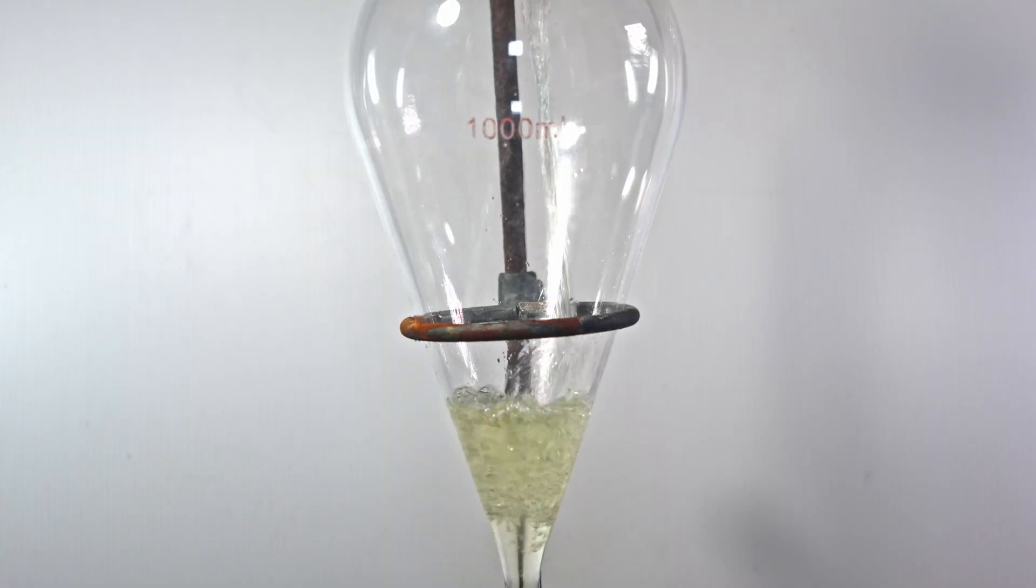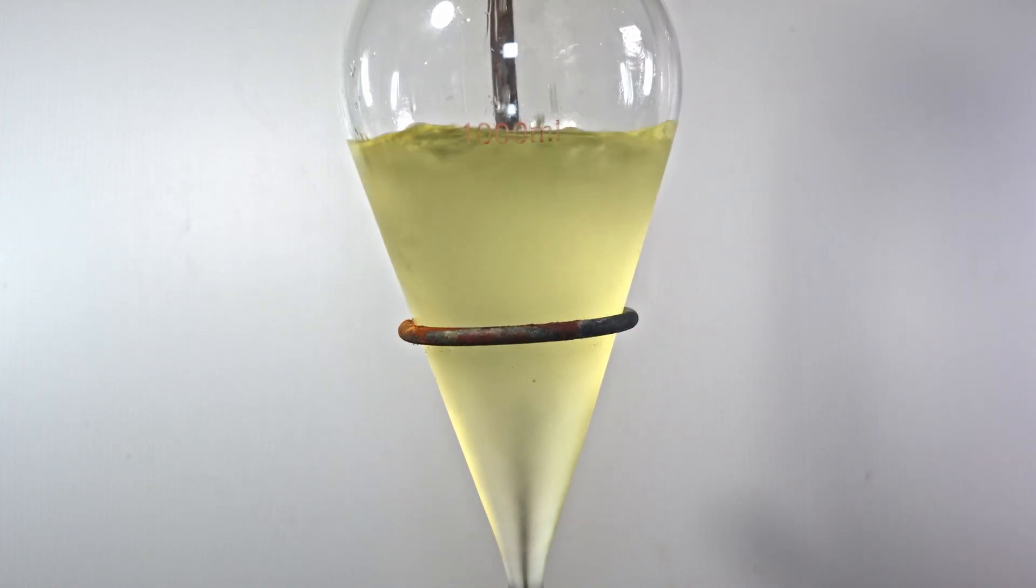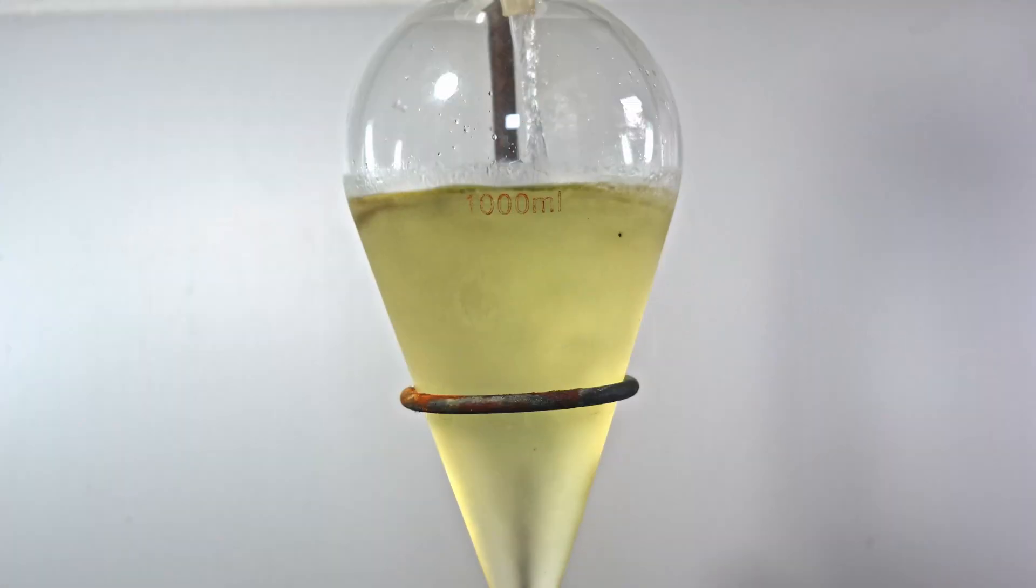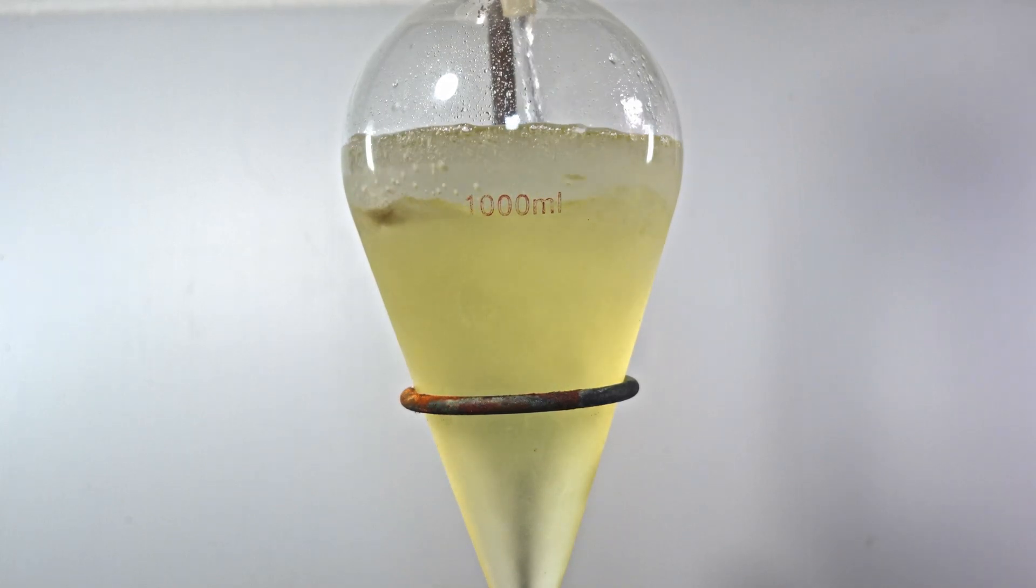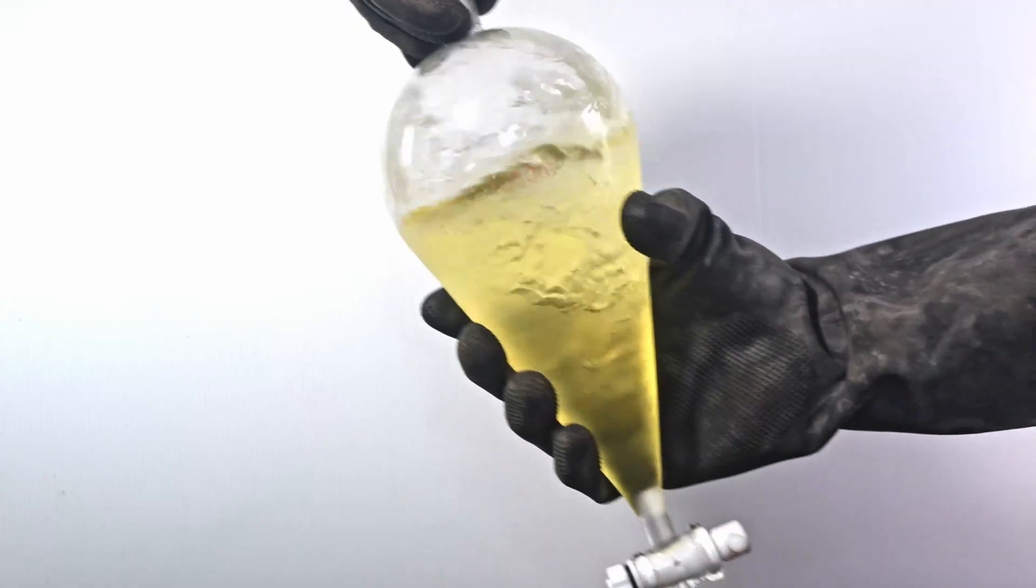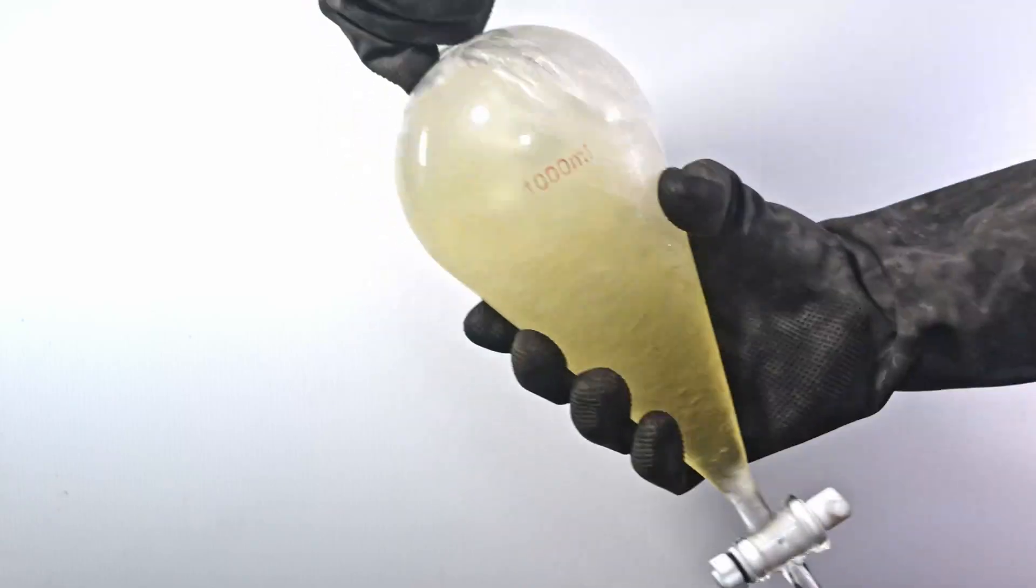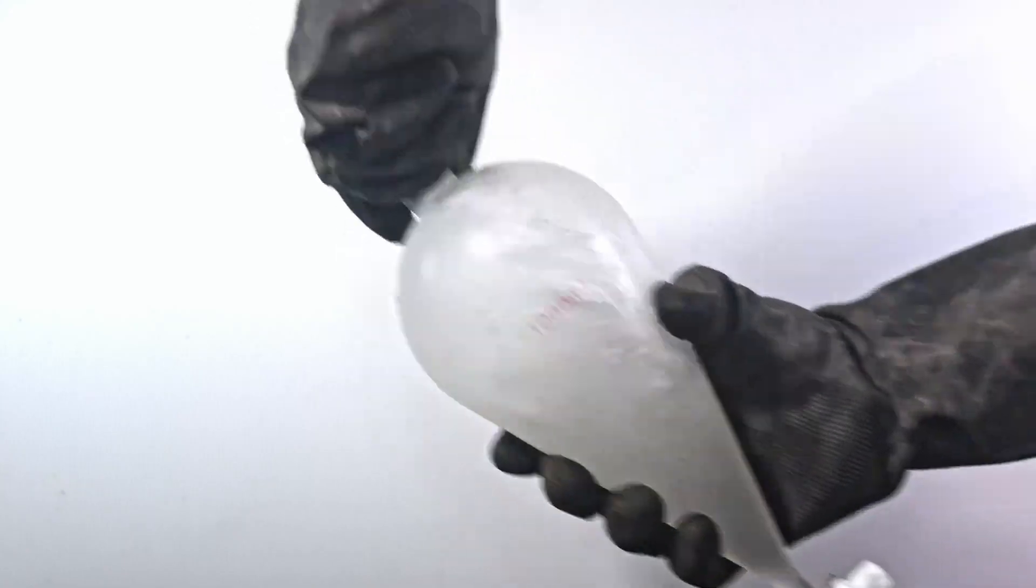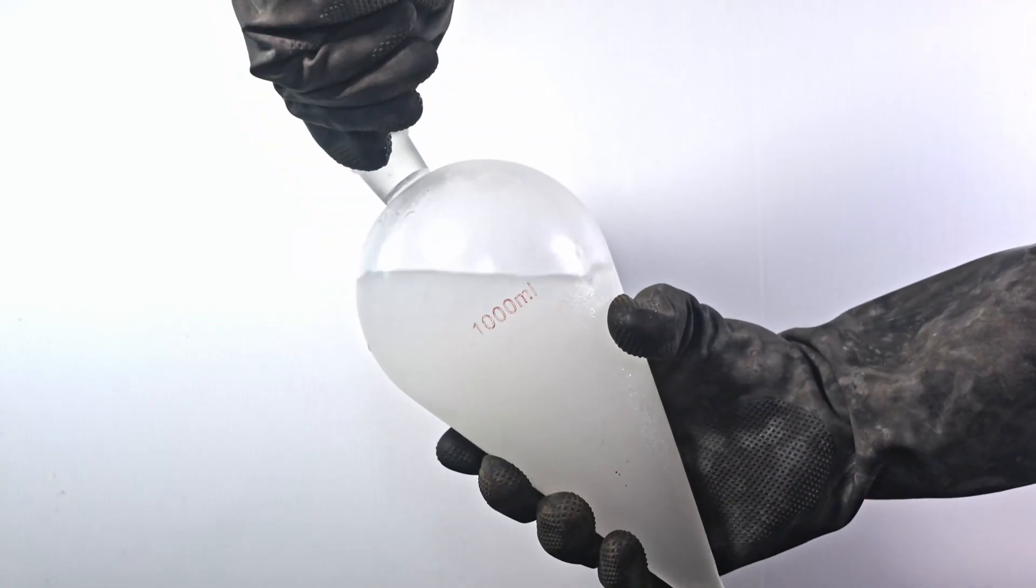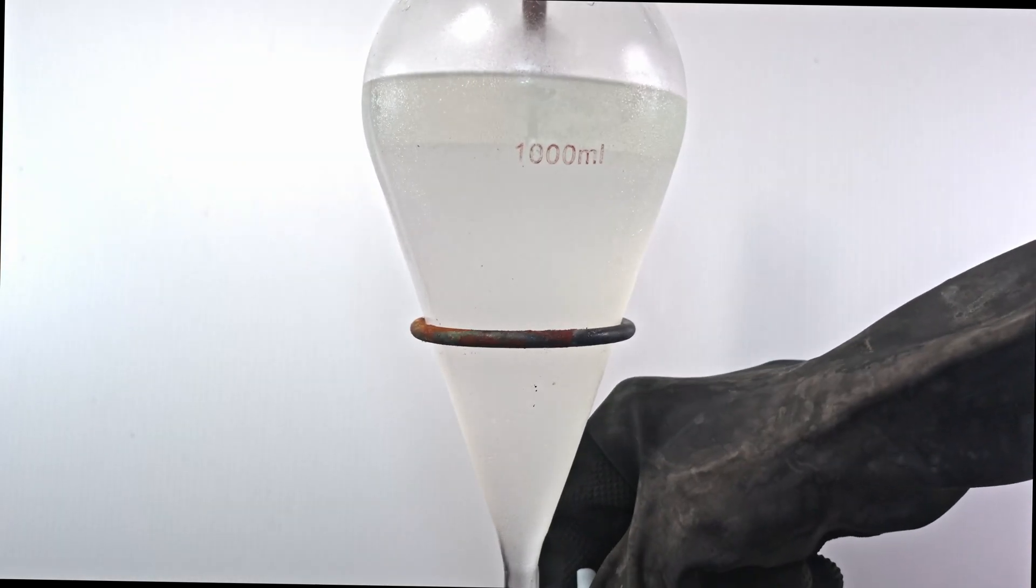To purify my isopropyl bromide, I first poured it into an addition funnel. While the oil doesn't come through, some of the colorants did. Next, I add 200 milliliters of saturated sodium bicarbonate solution. I give it a good shake to neutralize any of the remaining hydrogen bromide and suck out a lot of the water. One cool thing this also does is decolorize my crude isopropyl bromide. After the two layers separate, I drain off the organic layer on the bottom.